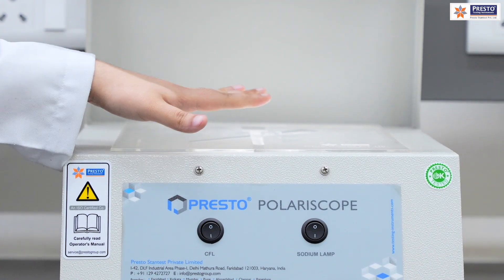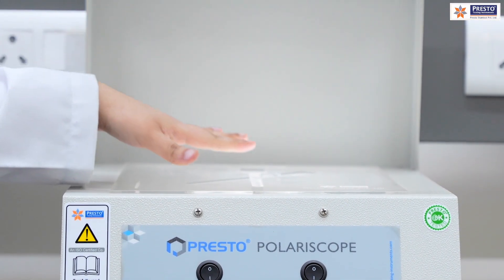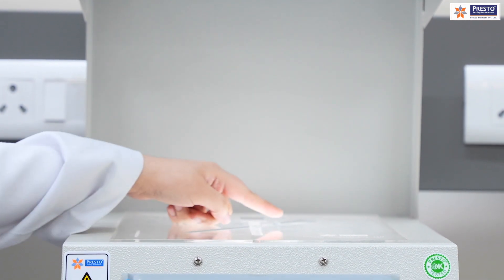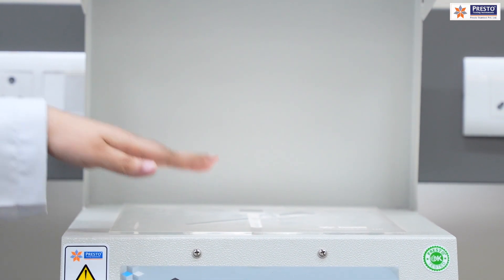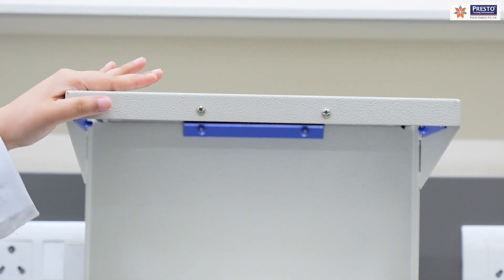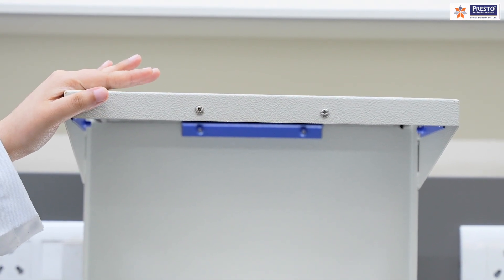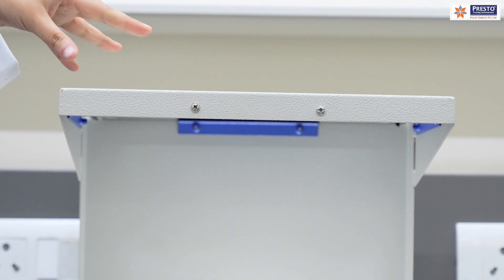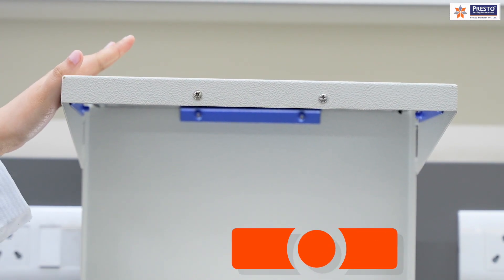This area is known as the polarizer, where we place the sample. We also have a template at 90-degree and 45-degree orientations. There is a viewing glass from where we observe the residual stress in the sample, and this part is known as the analyzer.